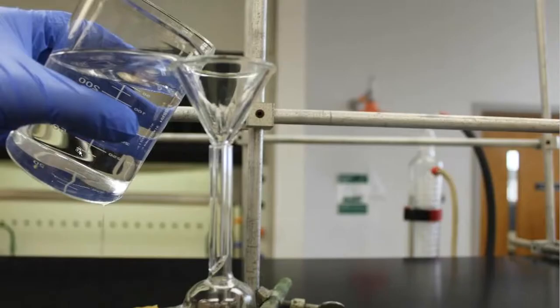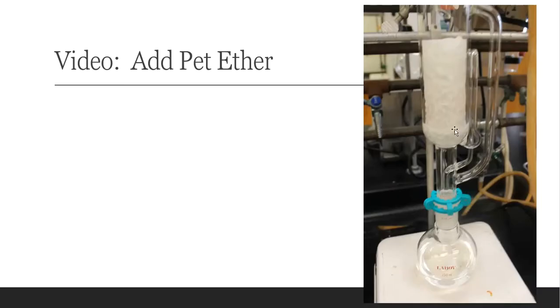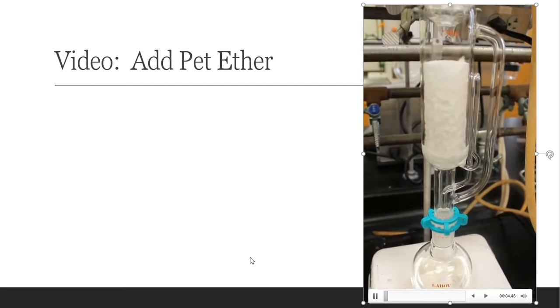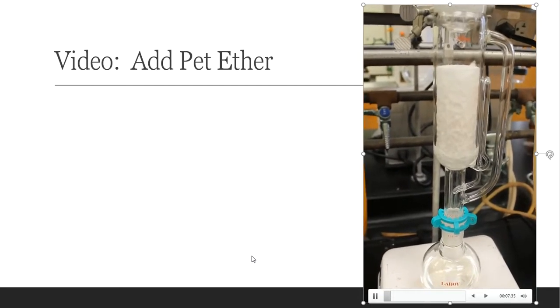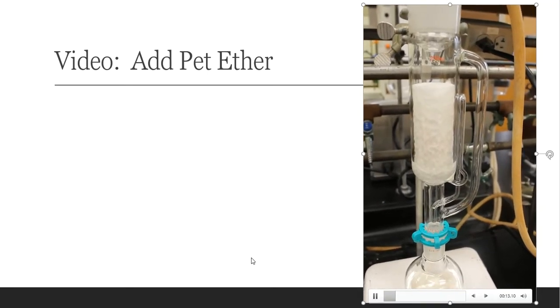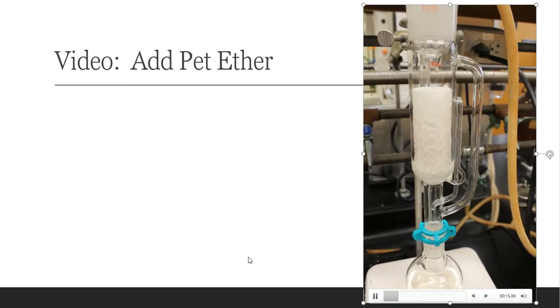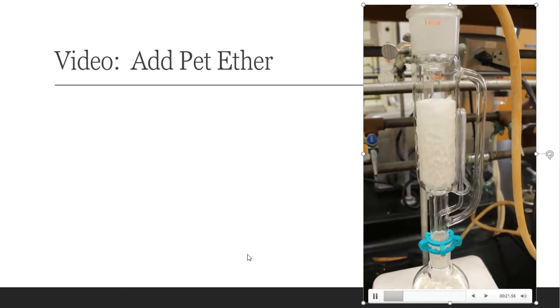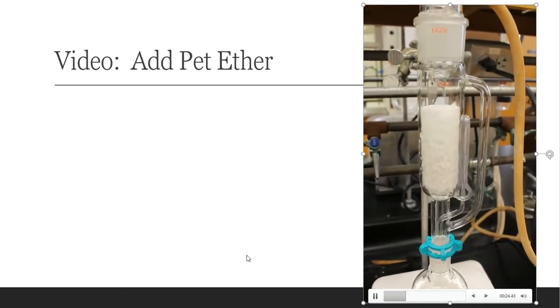So I've got my petroleum ether here in a beaker. I'm pouring it through the top with the help of a funnel, and it's going through my reflux condenser, and it's filling up that thimble so that way I can actually watch it drain. Okay, so what I'm getting ready to do, I'm going to pour some of this petroleum ether into the Soxhlet chamber. You're going to see that liquid slowly fill up in that area, and I want you to watch the drain that happens. So I'm going to fill this up enough so that two full drains will actually go on.